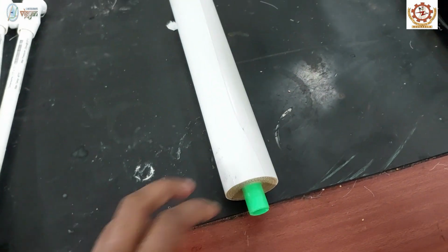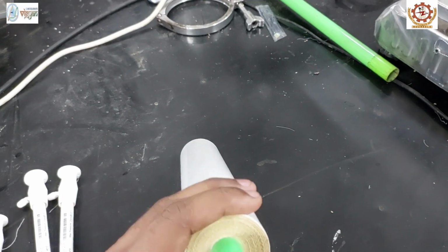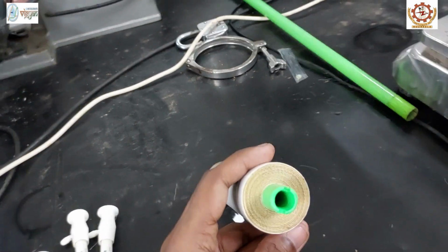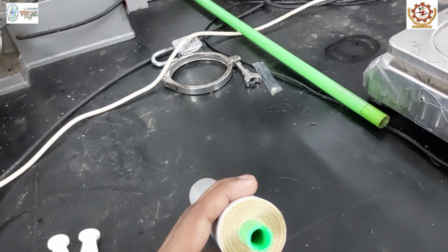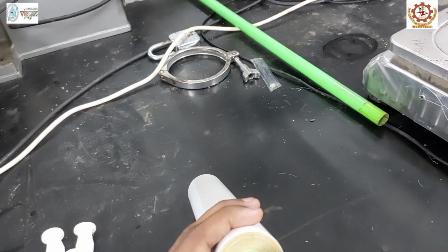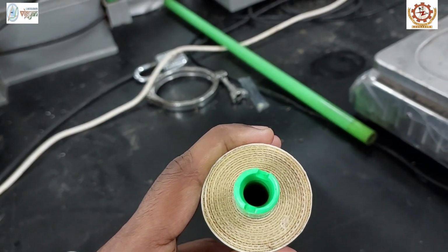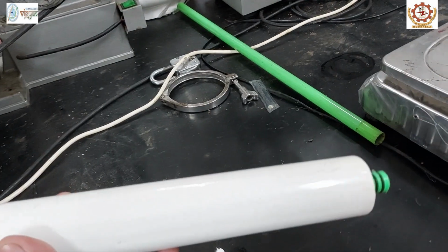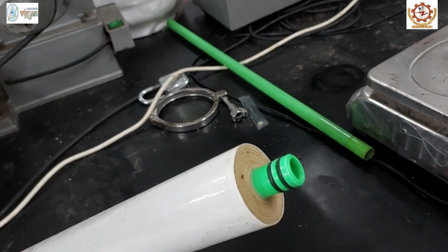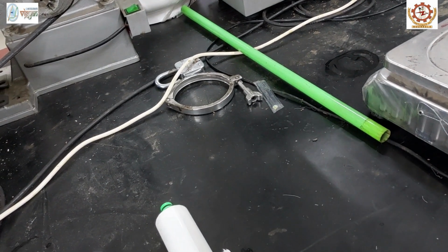Next, this is a spiral wound module membrane. In spiral wound module, two flat sheets of the membrane and a mesh-like spacer, typically 0.03 to 0.1 inch thick, are wrapped together and surrounded in a porous central tube. One edge of the membrane sheet has an opening near the central tube for collecting the permeate, while the remaining three edges are closed together.